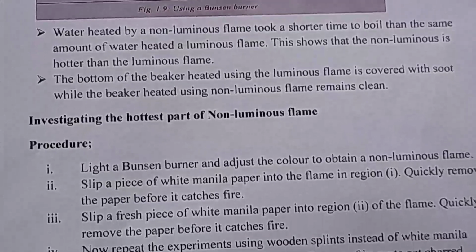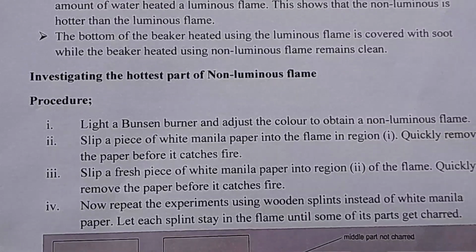Next, we are going to investigate the hottest part of the non-luminous flame. We say the non-luminous flame is hotter than the luminous flame. So which part is the hottest in the non-luminous flame?